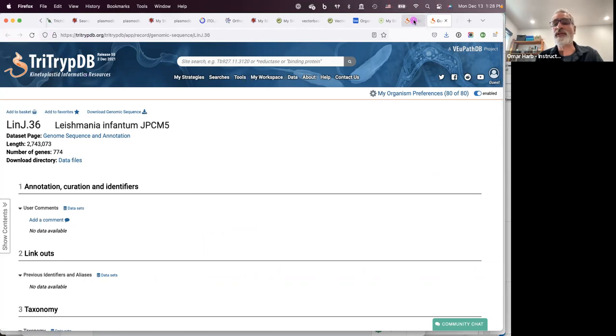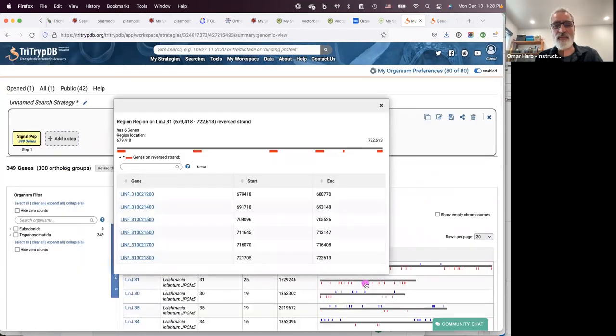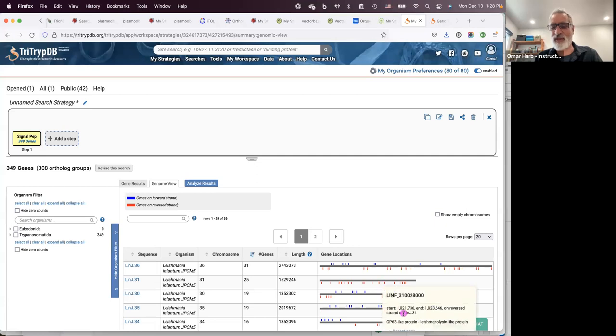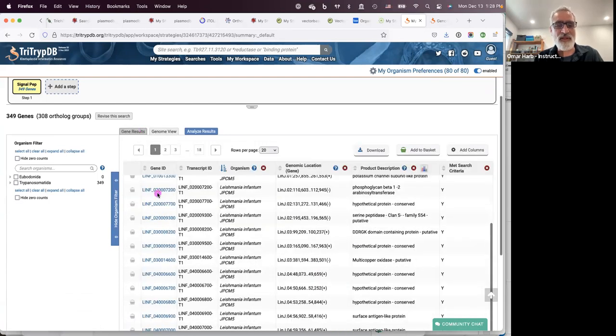Let me go to one of the genes. Sorry, Suzanne, I think you were going to say something as well. I did say JBrowse, which you've already said. JBrowse. Okay, perfect. So I'm going to click here and go to one of these easily. Or let me go back to the results. It's easier to click here.